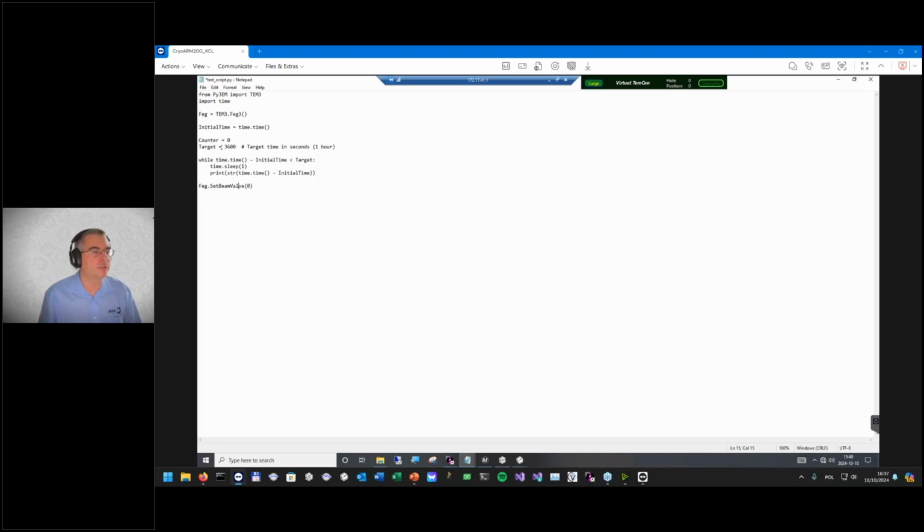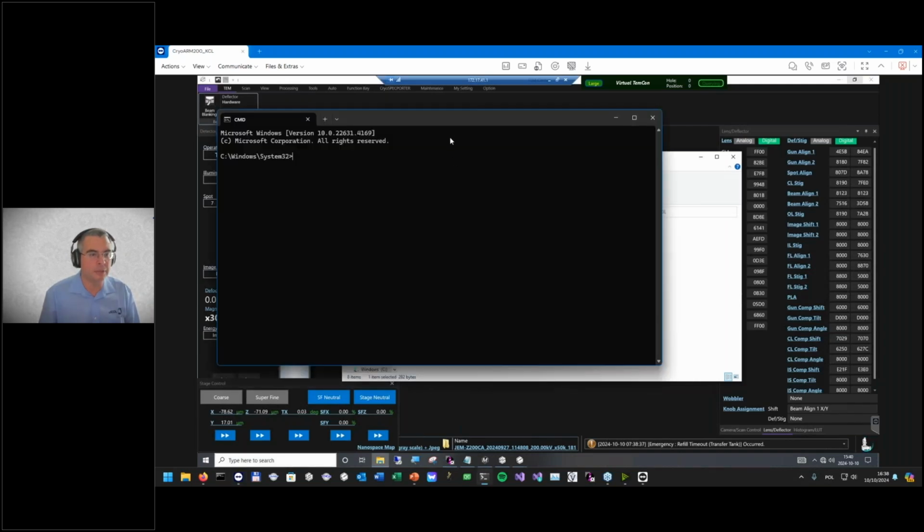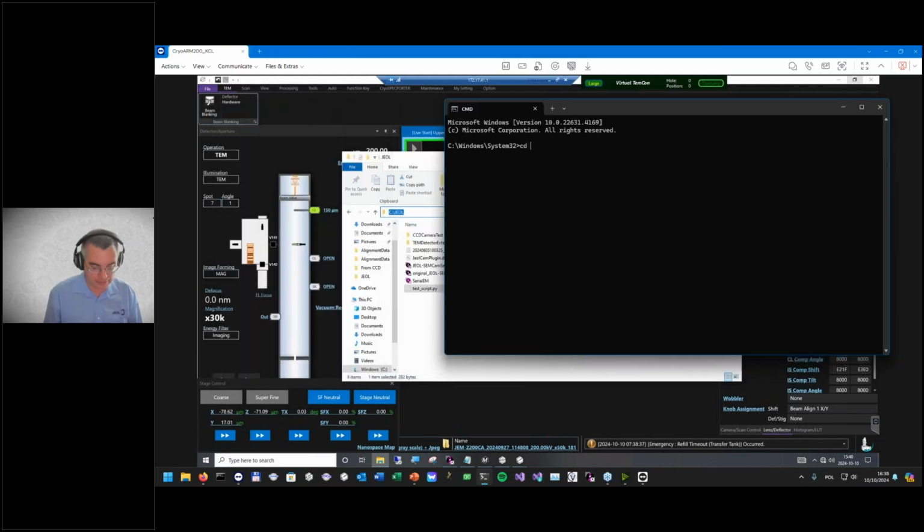This will be executed after 1 hour from the moment the script is started. So something as simple as this. Now, all I've got to do is to change the name, change the extension of the script and run it to show you what's going to happen.